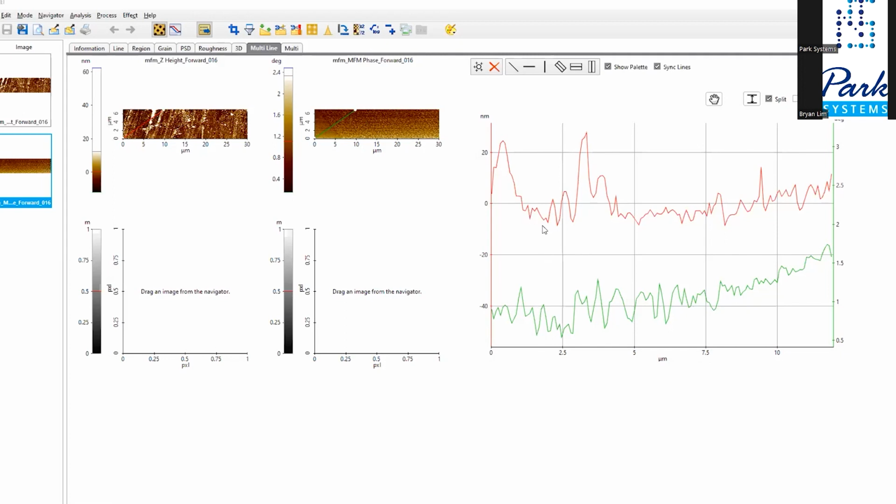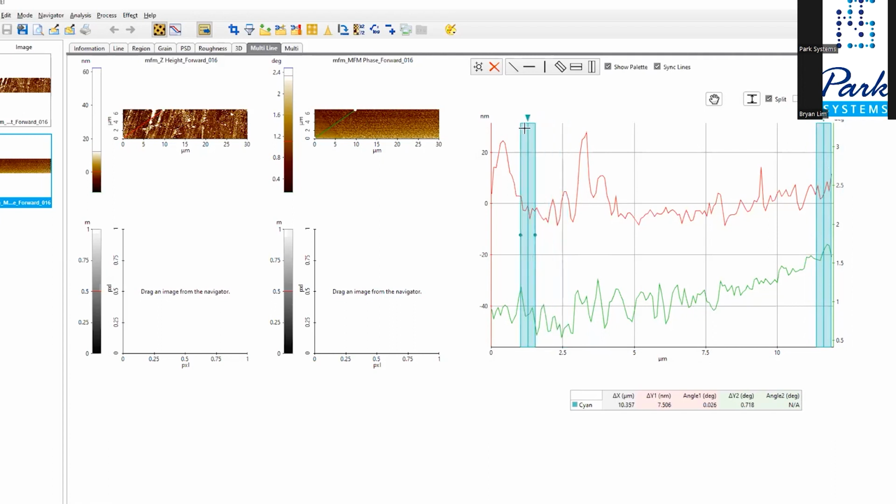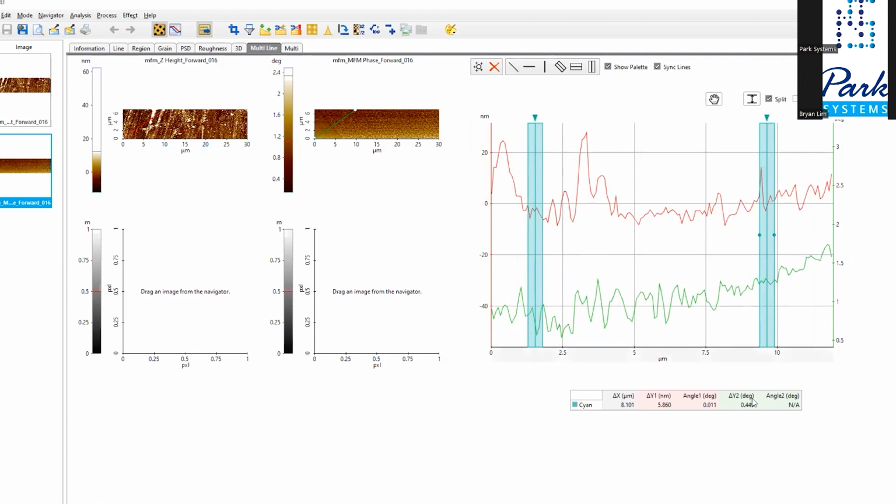You can also put in some cursors where you can average out, like to find out how strong is the region. You can share average cursors to find the strength of the magnetic field in degrees. So for this one is in the green region and it's Y2. Right, so you can also do analysis, multiple lines, and compare.